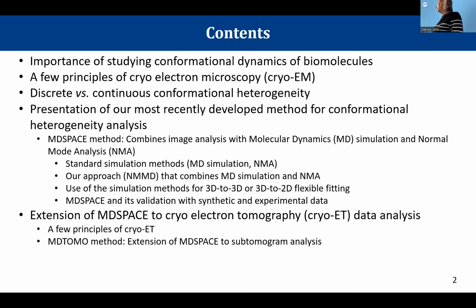And just briefly, the difference between cryo-ET and cryo-EM is that cryo-ET allows you to look at these conformations in the cell.